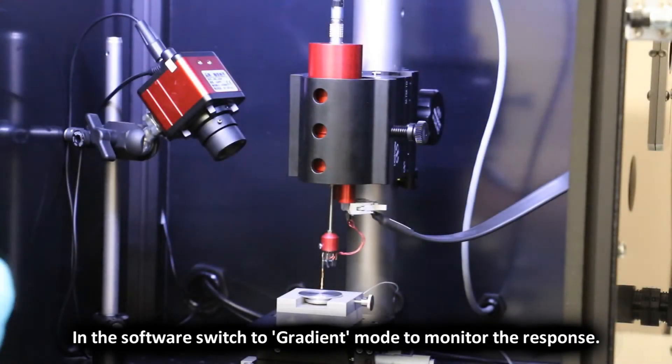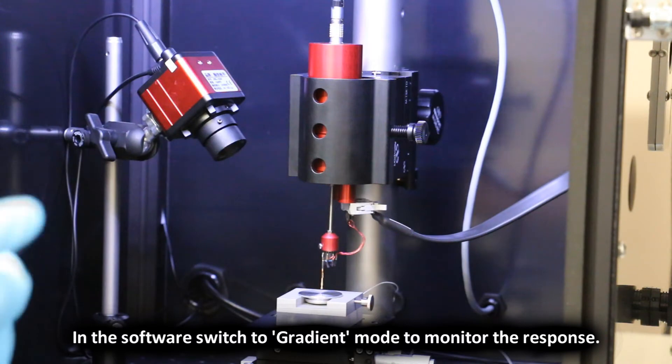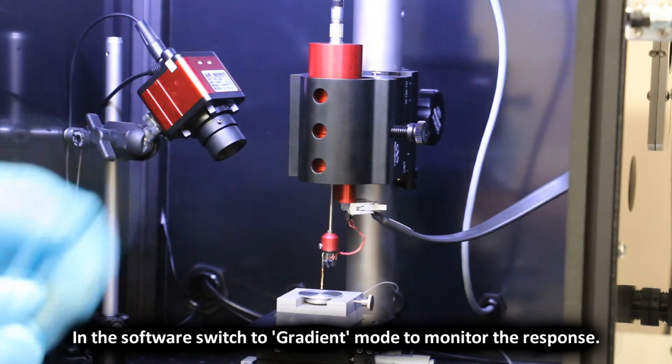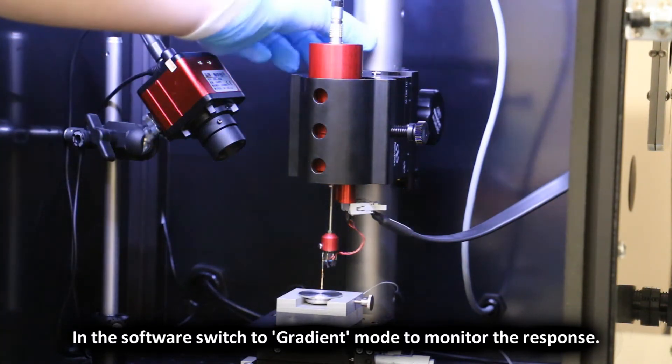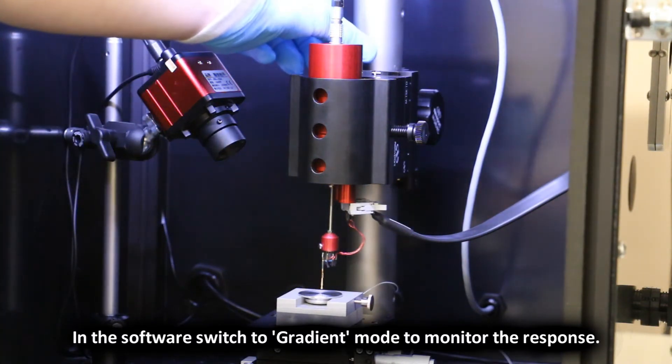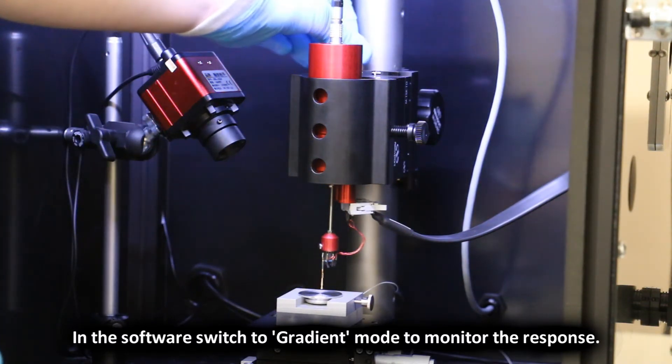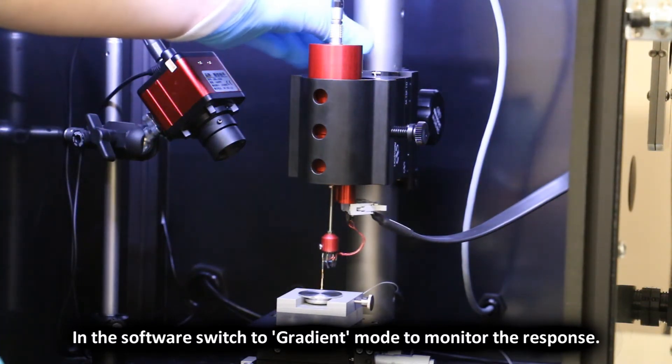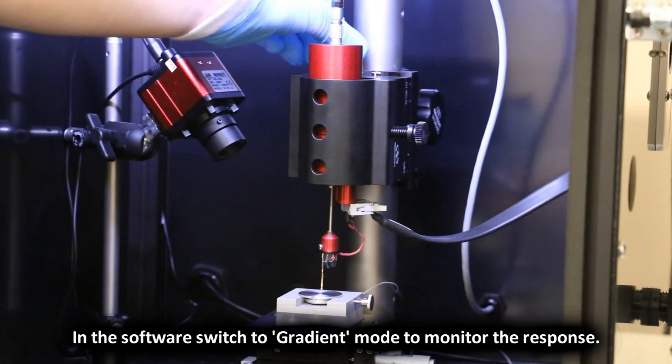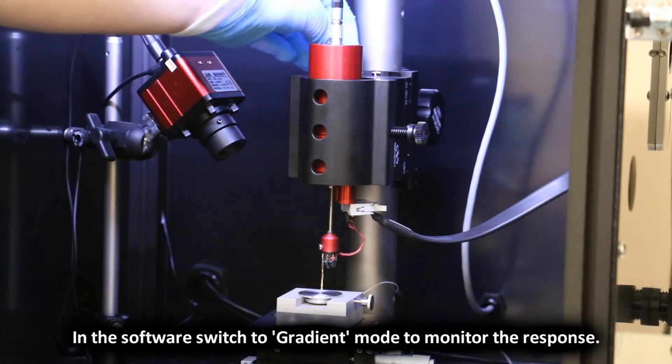Using the probe mount adjustment knob move the tip closer to the sample. Keep moving the tip closer until the gradient value reaches 300.